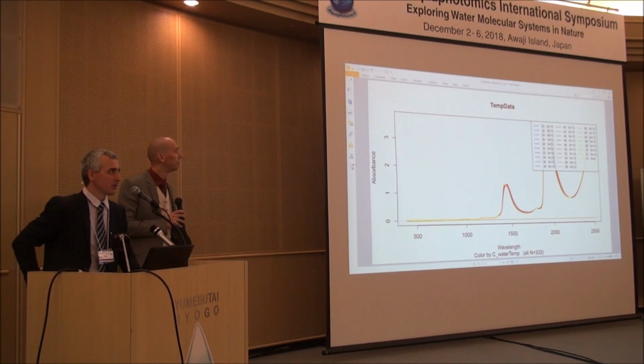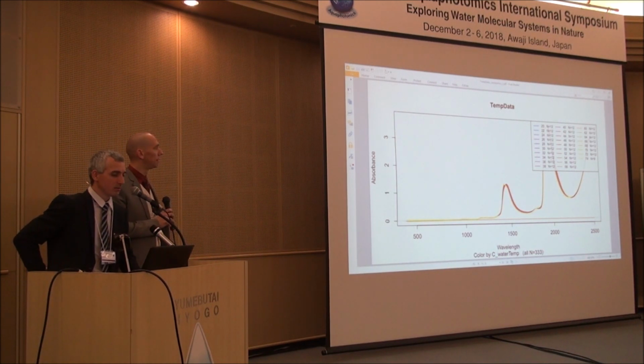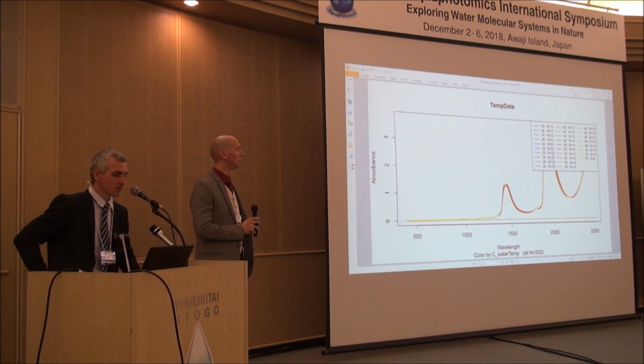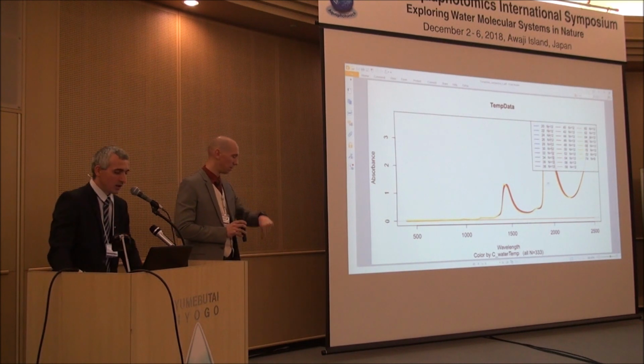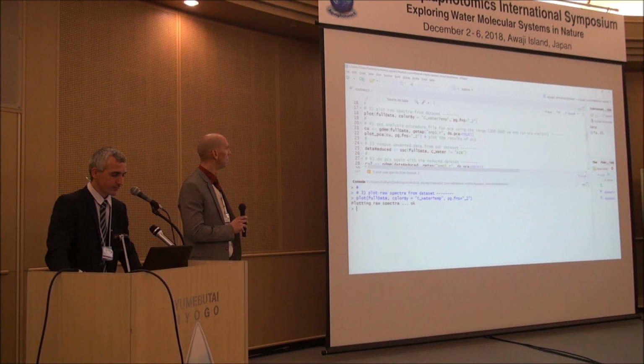Okay, so the data set we have now for this demo for today, for this course, is temperature data set. We acquired temperature of spectra of 3 types of waters at the temperatures displayed here, plus we measured air in between blank spectra. So let's continue with the data analysis.